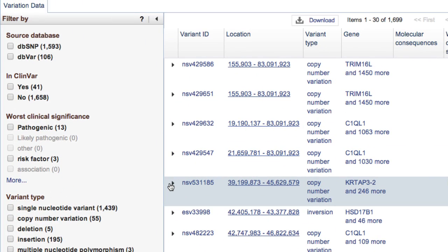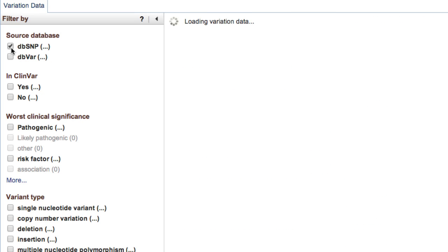To the left of the variant table is the filter component. Check the boxes for the variants you want displayed.